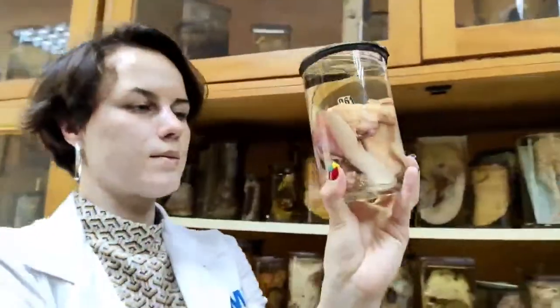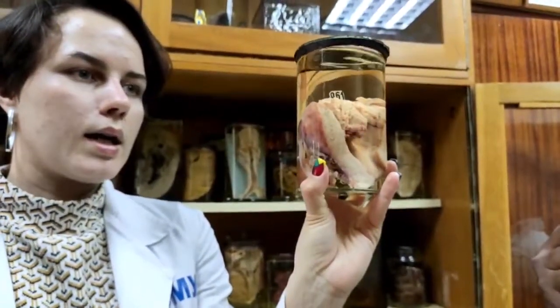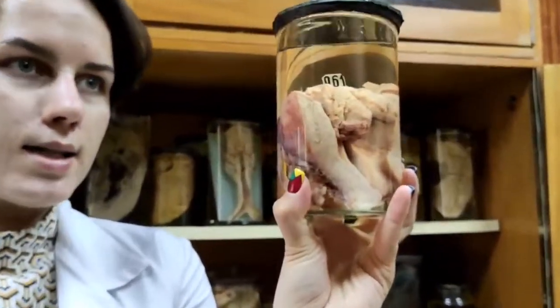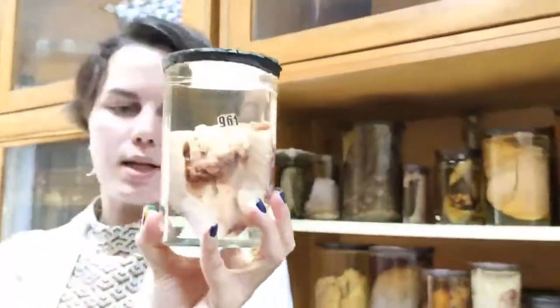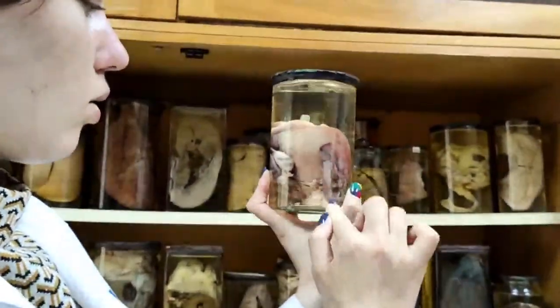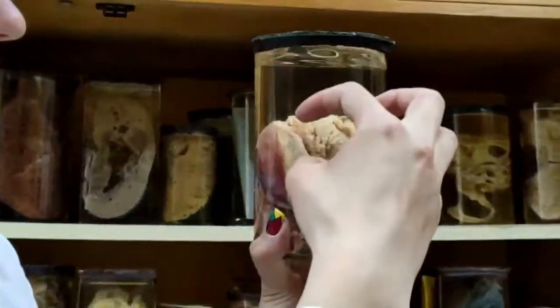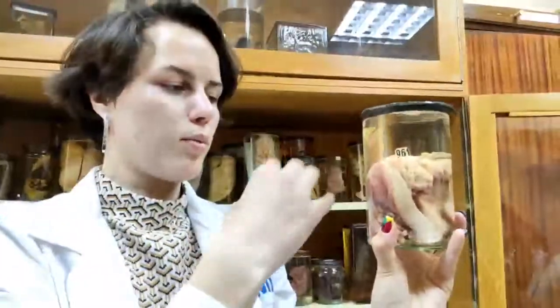The next specimen is uterus with endometrial adenocarcinoma. Endometrium is also composed of glands. That is why when you see malignant tumors in the endometrium, this tumor is also adenocarcinoma. Here you can see the cavity of the uterus and ovaries with fallopian tubes. In the center of the cavity, you can see an exophytic tumor. Exophytic means that the tumor grows into the cavity, not deeply into the wall, and we can see this tumor as a polypoid substance.